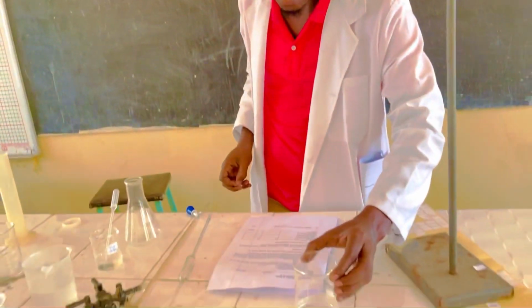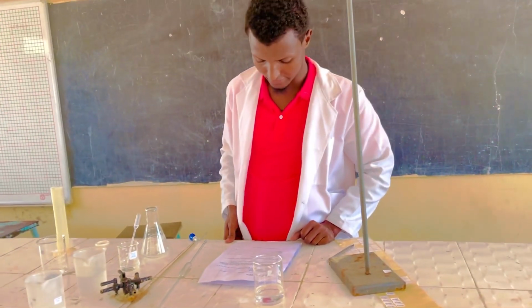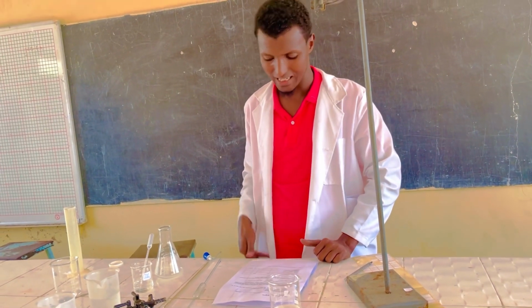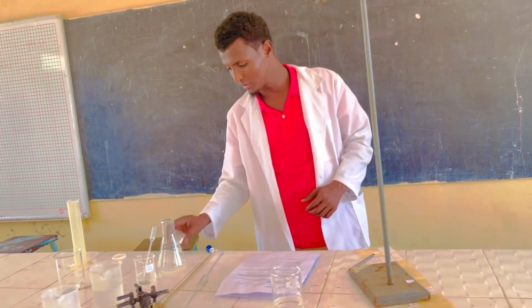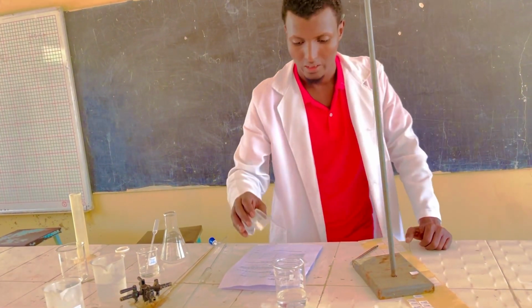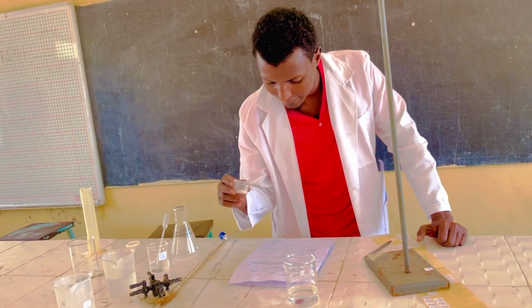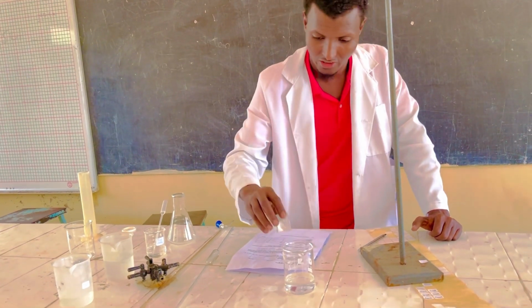we have done that. We are told to add all sodium carbonate, solid V, to the acid in the beaker and stir gently.